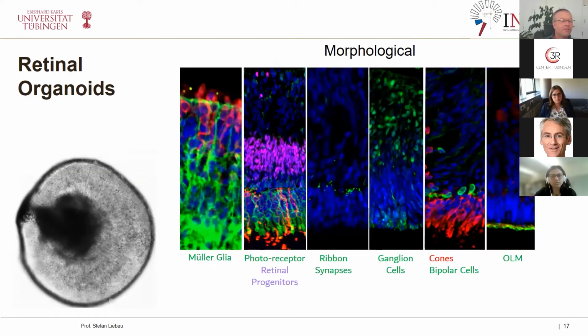I said that the lamination of the human eye is really complicated, and lucky for us, biology knows that, and also developmental biology. So if you take cells from the retinal field from your cultures and you leave them alone in a 3-dimensional room, in media, then the lamination is done by biology and by life. So after a while, around 80 to 100 days, you see lamination.